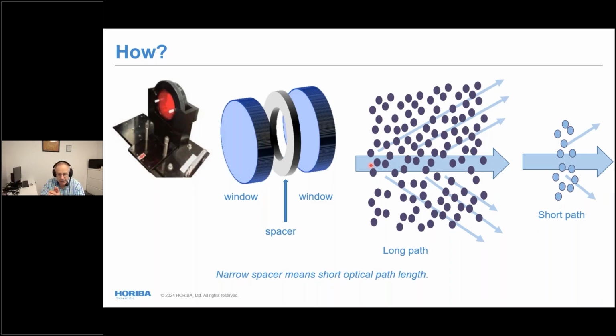One set of effects is that as the concentration gets higher, you're going to have contact between particles or chemistry happening, and optics can't fix any of that. The other is that as you have more and more particles, the probability of secondary scattering gets higher and higher. By taking the typical long path length and making it very, very short in the HL cell, like I show on the right, now light strikes a particle and it leaves before it has a chance to find any other particles. And so it's really the short path length that lets me get to the higher particle concentrations.